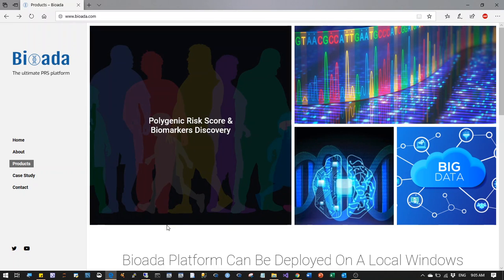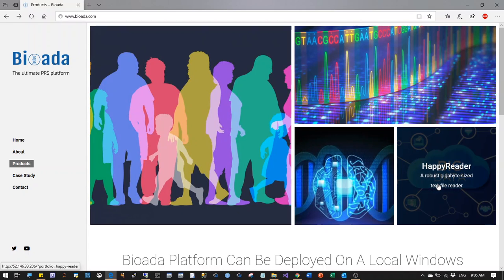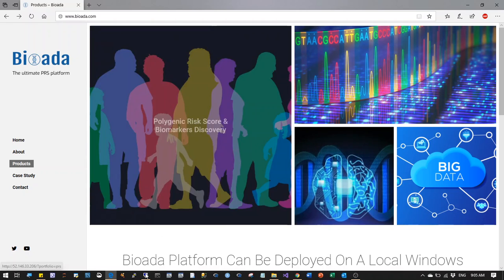Bioada has 3 products: Smart Array, Xarang, and Happy Reader. In this video, we are going to talk about Xarang, a powerful real-time machine learning toolbox, which is very suitable for analyzing genomics data.